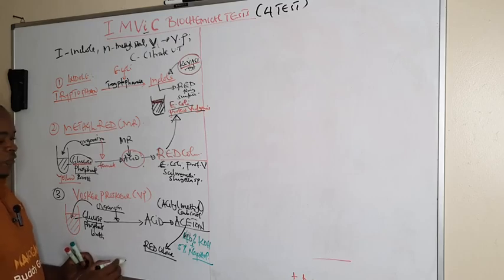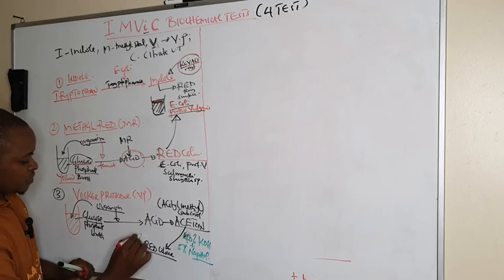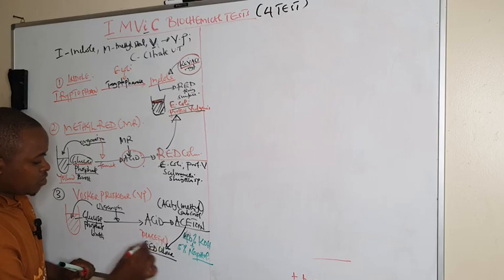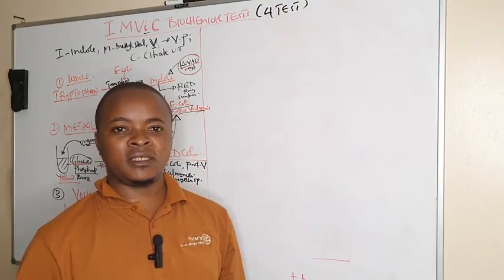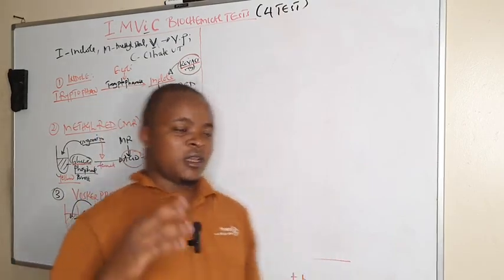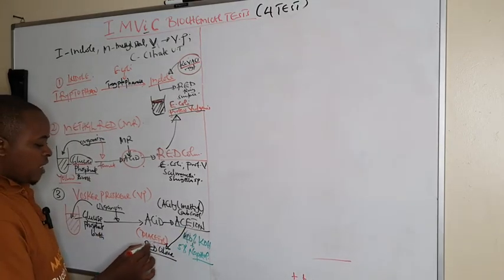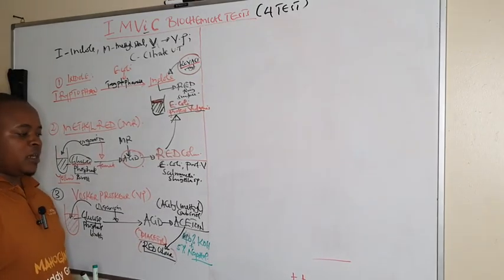So red color is formed due to the formation of diacetyl. This one is due to the formation of diacetyl compound on addition of 40% potassium hydroxide and 5% alpha naphthol, which converts acetoin to diacetyl compound, which produces the red color.